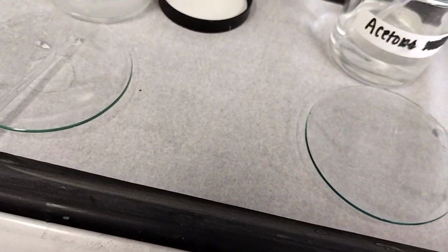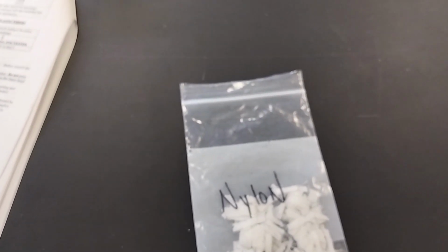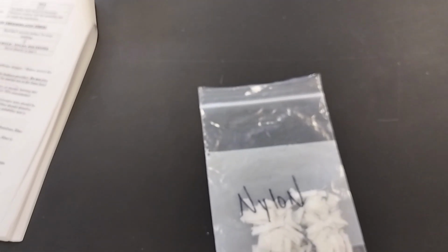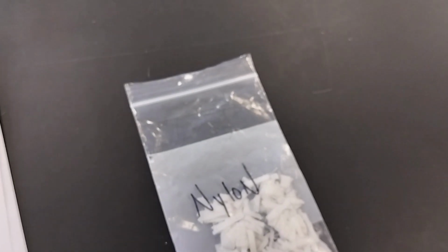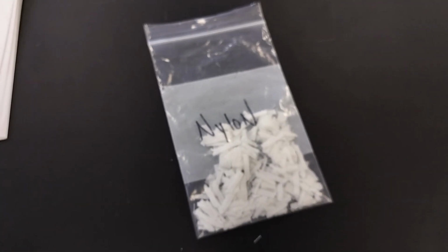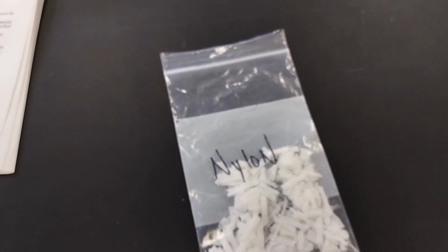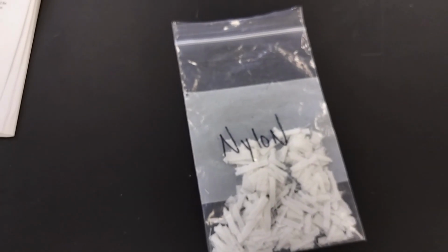Now we are going to test the next fiber. After visual inspection, burning test and microscope observation, if you narrow down that the sample is synthetic, we use chemical testing to confirm the exact fiber name. For now, let's assume we don't know the fiber name precisely, but we are certain that it belongs to the man-made synthetic group.